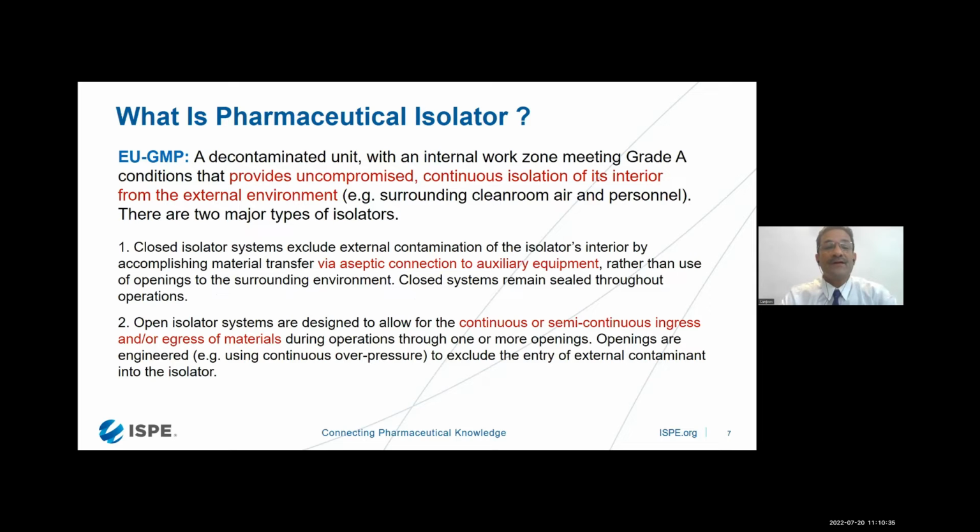There is a definition also coming from EU GMP, which says that it's a decontaminated unit. So everybody is talking about the same thing: a decontaminated unit wherein the internal is separated from the external environment.